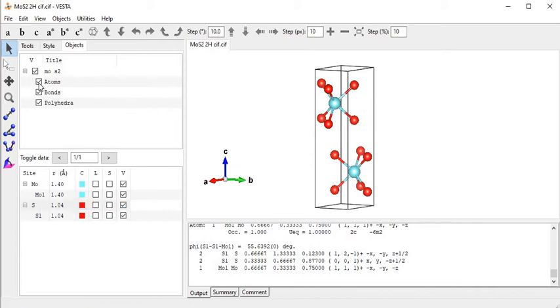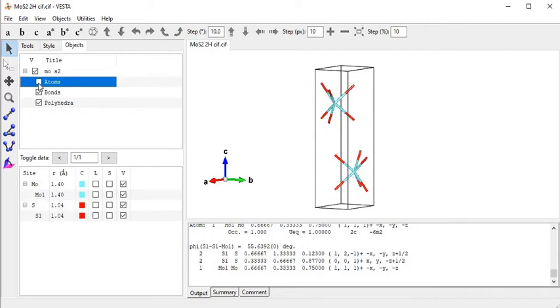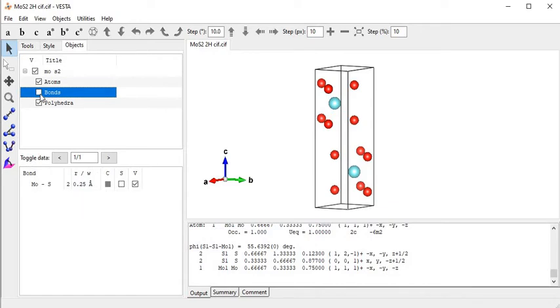We can also change the view - clicking on the atom part removes the atoms from view. If I want to see atoms again, click on the atom part. For bonds, if I do not want to show bond angles, just remove the tick from the tab.